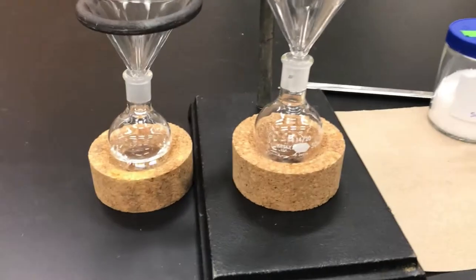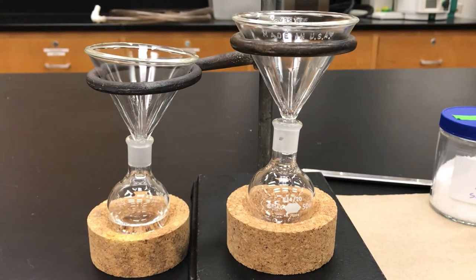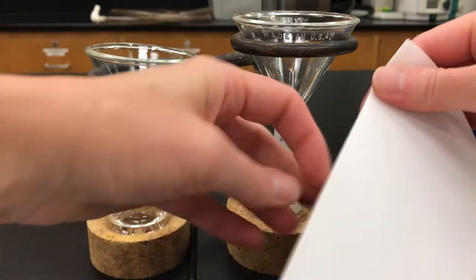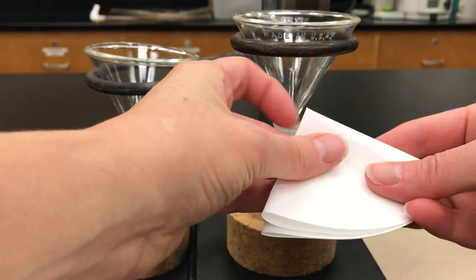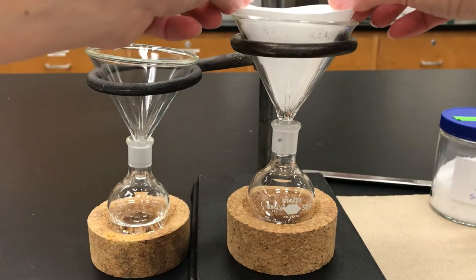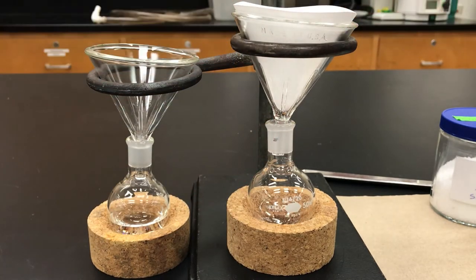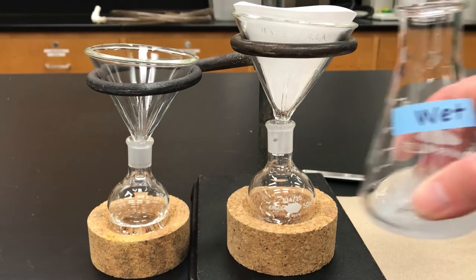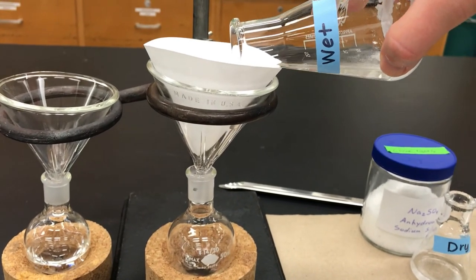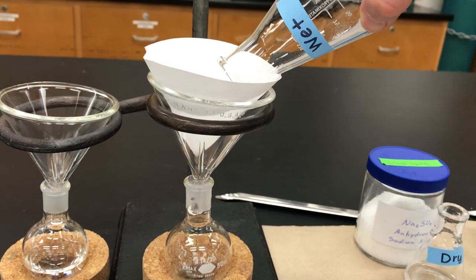With magnesium sulfate being so fine, you'll have to filter it instead. Get a funnel and a filter paper, do a simple fold in four, open it up, put it into the funnel, and pour your mixture in. This is called gravity filtration. All those fine particles get trapped in the filter paper, and in that way you remove the drying agent.